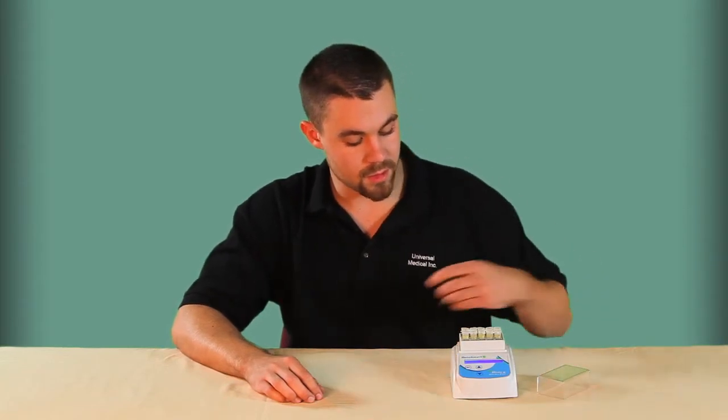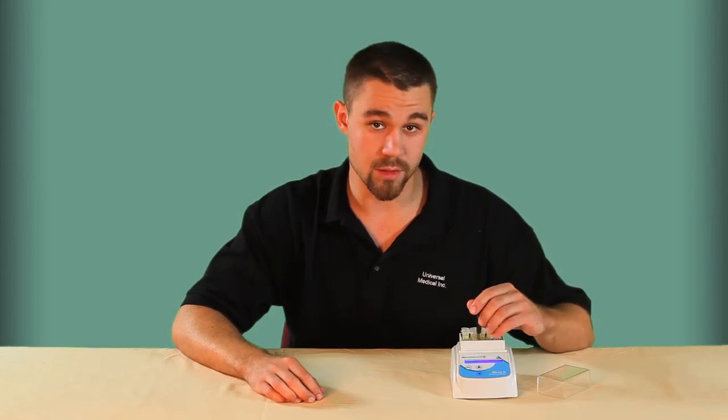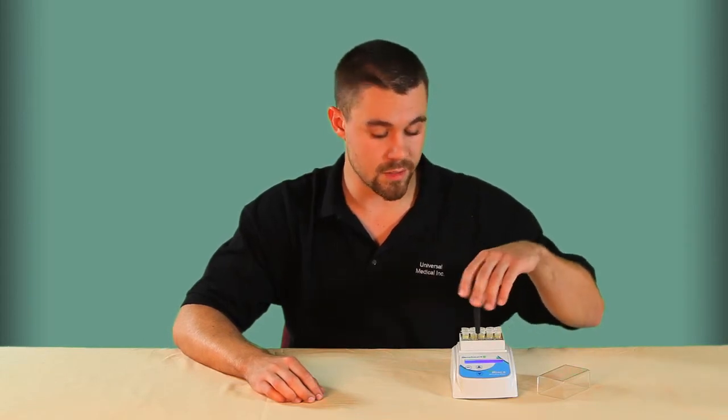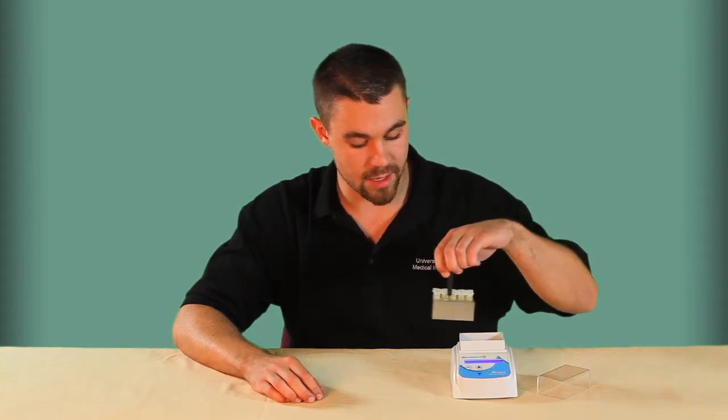Now you can choose from nine different blocks which can hold either 0.2 milliliters all the way up to 50 milliliters depending on what kind of microtube you have.